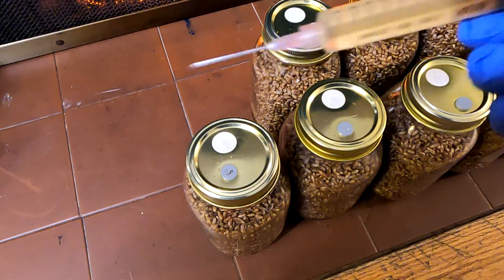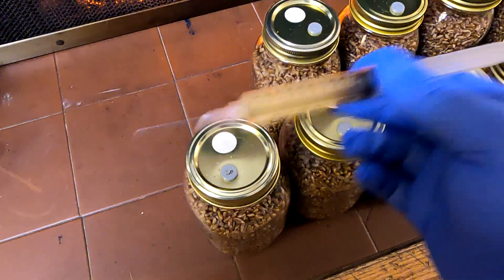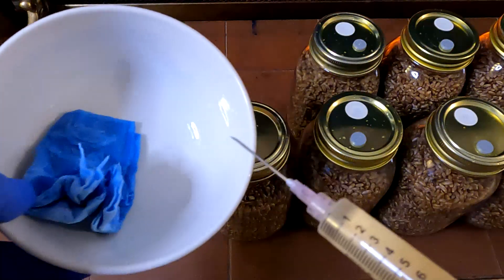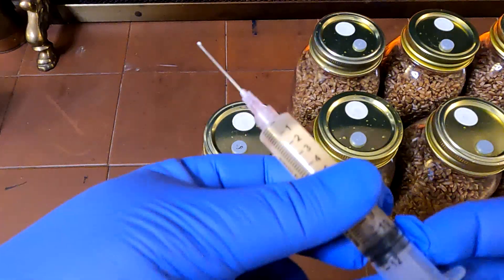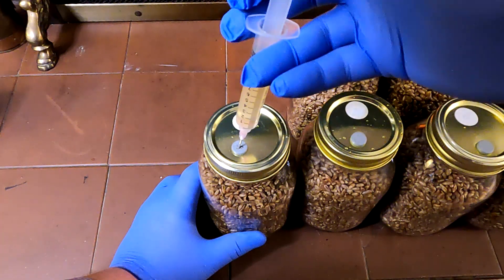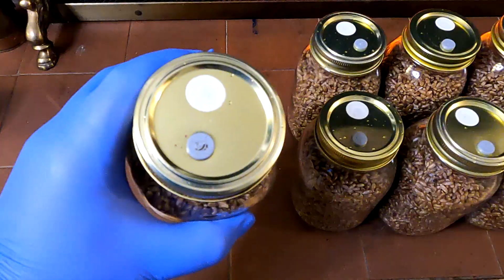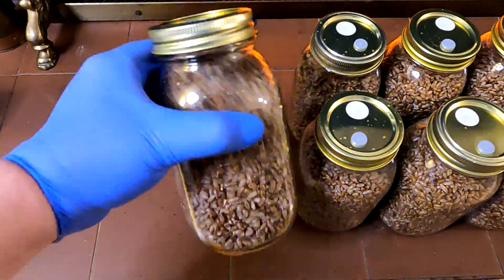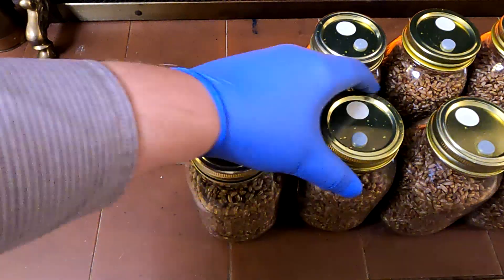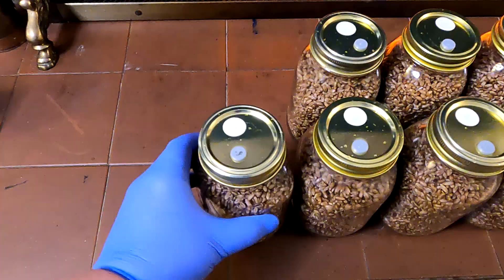Since we've got 10 jars and about 10 or 11 milliliters in here, I'm going to be putting one CC per jar. Before we do that, we want to shake the syringe up really well, and I'm just going to squeeze the first little bit out. After you inject each jar, you just want to give it a little shake — it's actually a good idea to do this before you inject it as well, just to make sure the grain's not stuck together and there's plenty of oxygen to circulate throughout, which is going to help for a healthy mycelium set.